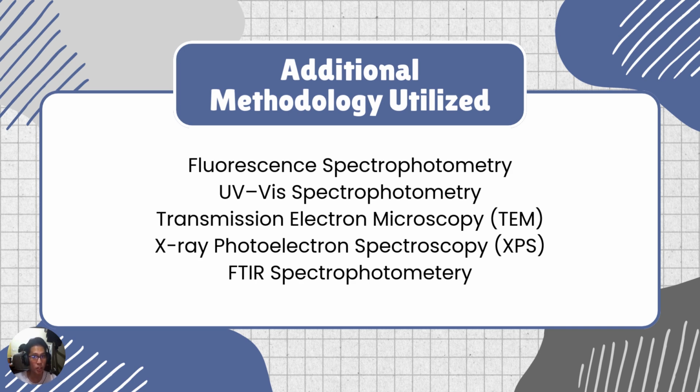These are a few additional methods used: fluorescence spectrophotometry, UV-vis spectrophotometry, transmission electron microscopy or TEM, X-ray photoelectron spectroscopy or XPS, and FTIR spectrophotometry.